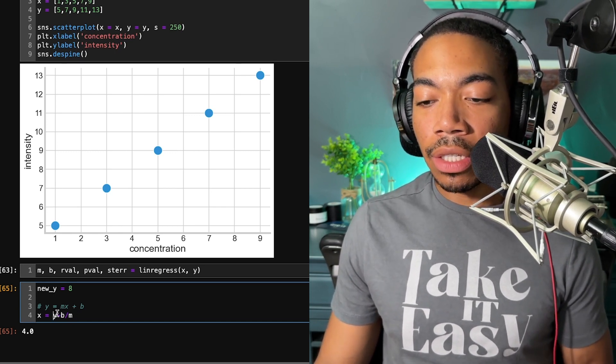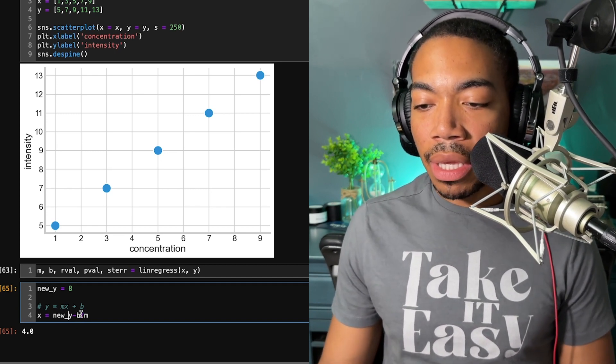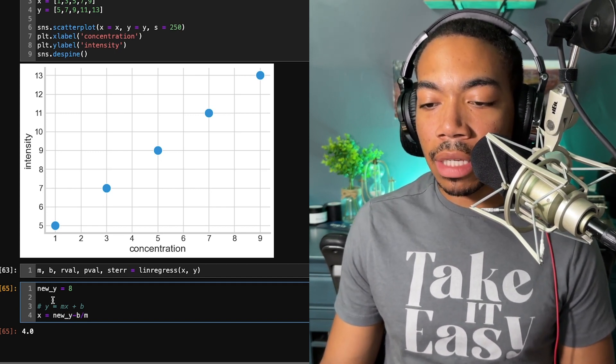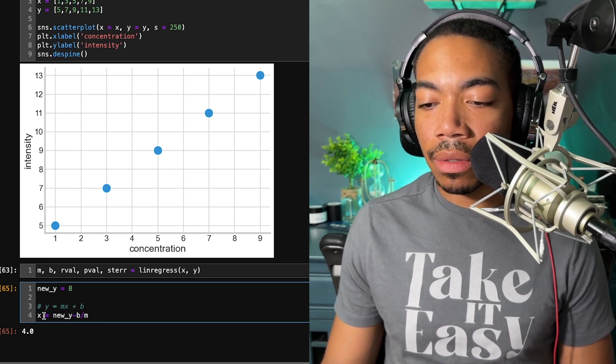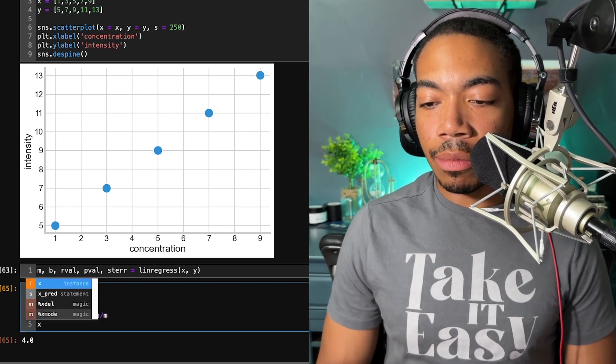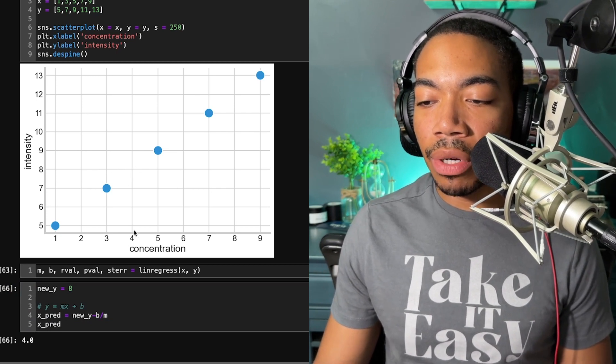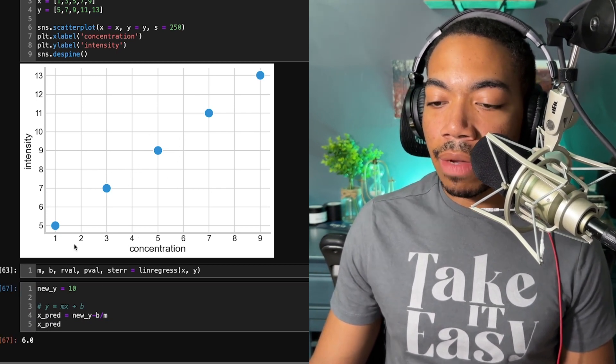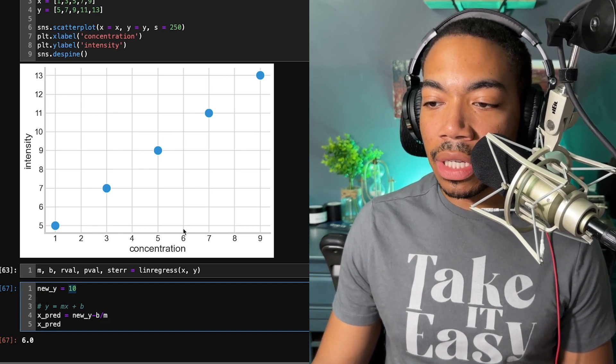And so if we actually use this, instead of y, we say new y, b and m come from our estimated parameters, and we set this equal to x predicted. And we look at x predicted. You see that x predicted when y equals 8, the predicted concentration is 4. If we look at y equals 10, our predicted concentration is 6.